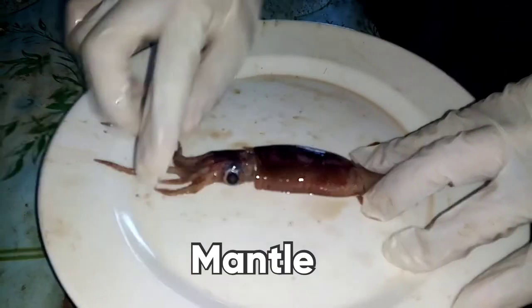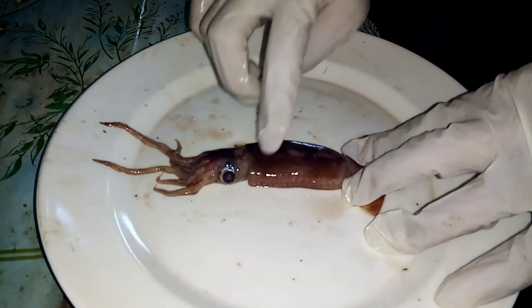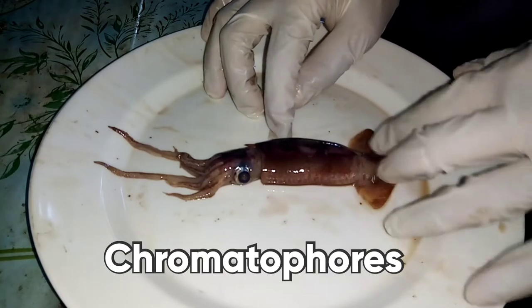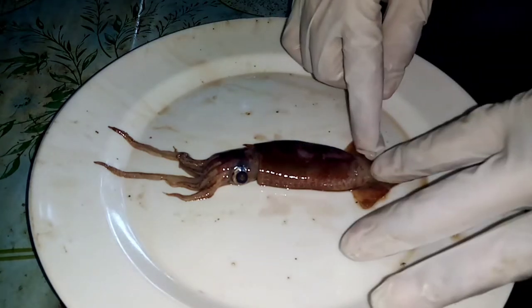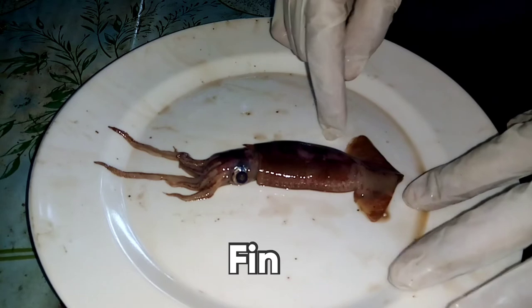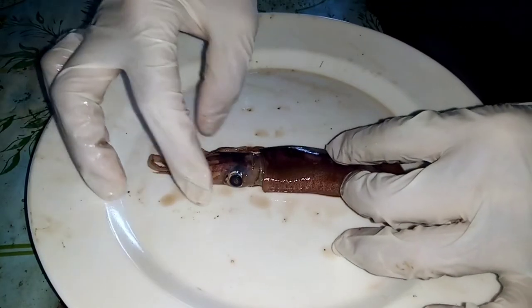And as you can see, it has tiny dots. They are called the chromatophores. And towards the mantle, it has 2 flaps that can be considered as the fins. So these are the fins of the squid. And this is the eye.